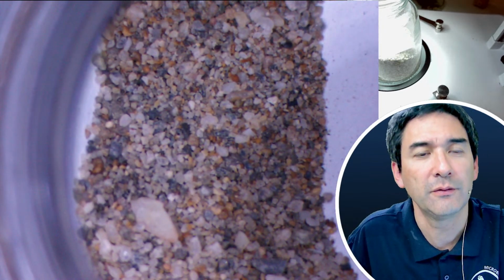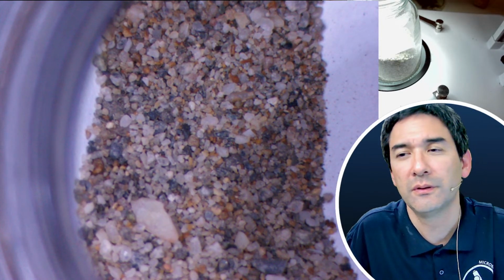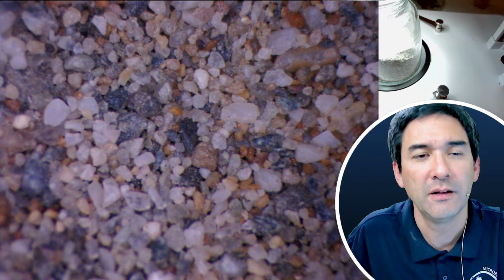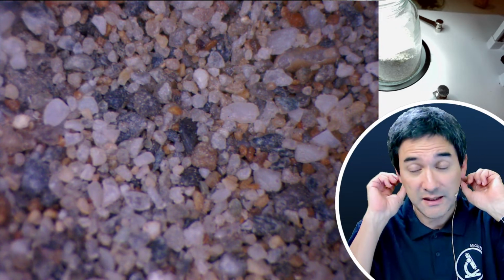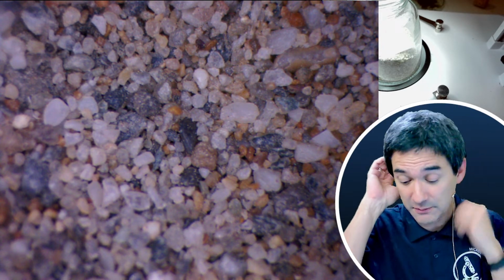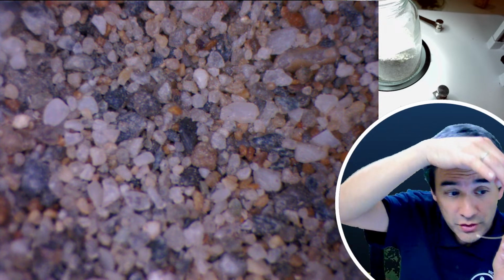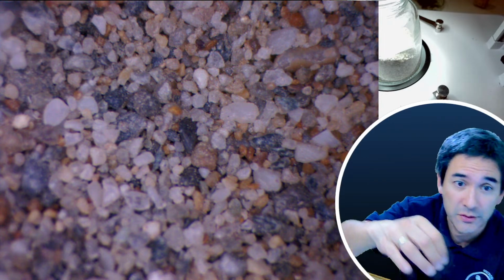It's also pretty colorful. Ah, people are waiting for the polarized light. Okay, so you have to give me 10 seconds to quickly jump up and get the polarized light filter. It's just across the room.